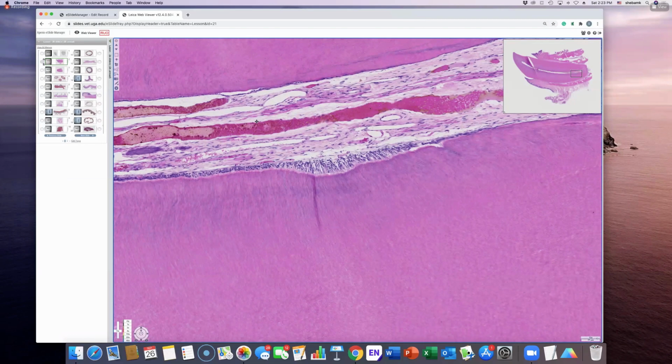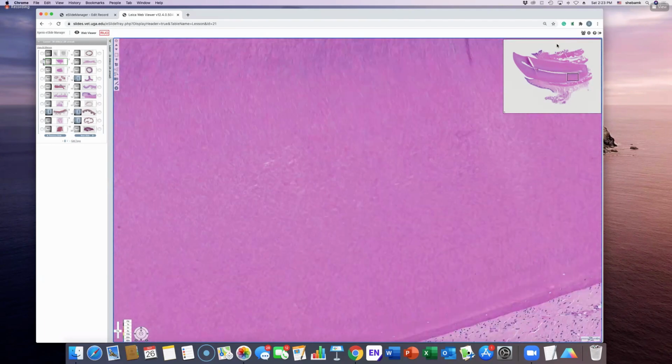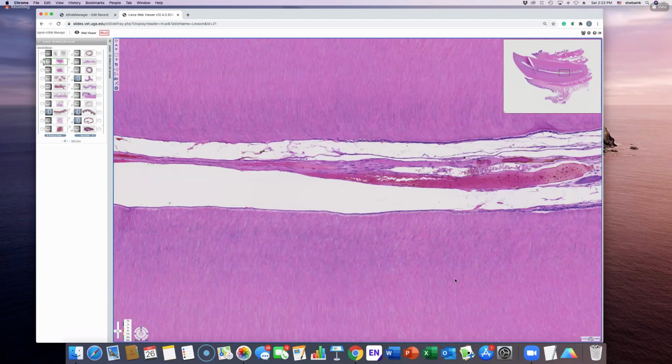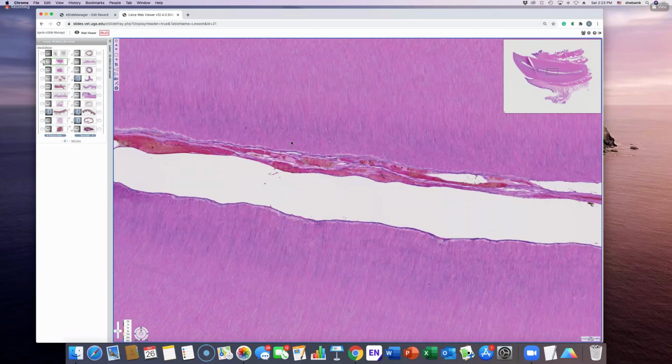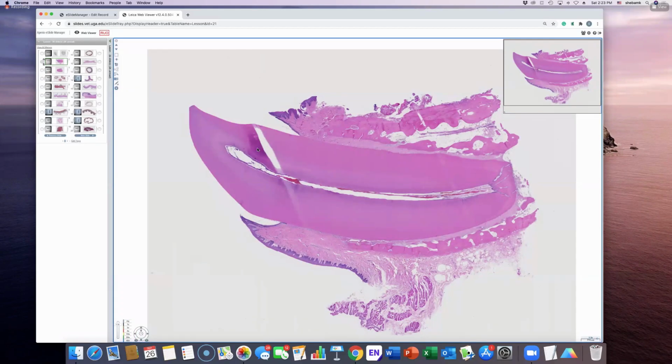Pulp cavity. And here you're able to see the predentin, or the odontoblasts. Awesome. Okay, there is the predentin. Here are the dentin tubules themselves. Okay, very nice. Okay, let's go. So that is it for the tooth.